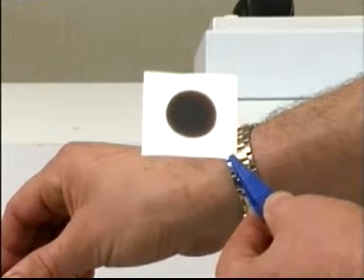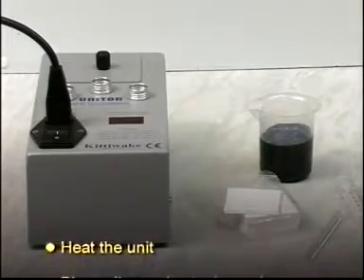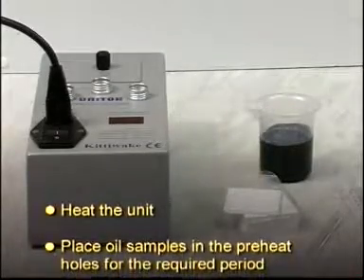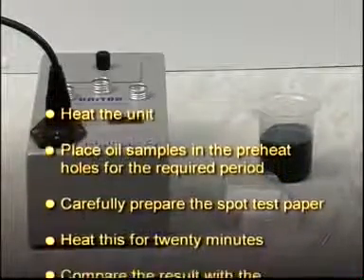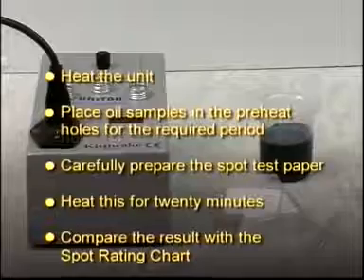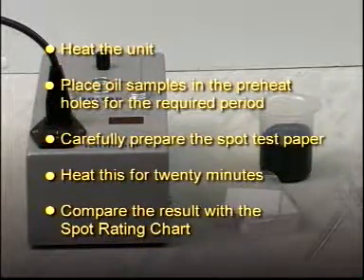To summarize: heat the unit, place oil samples in the preheat holes for the required period, carefully prepare the spot test paper, heat for 20 minutes, then compare the result with the spot rating chart.